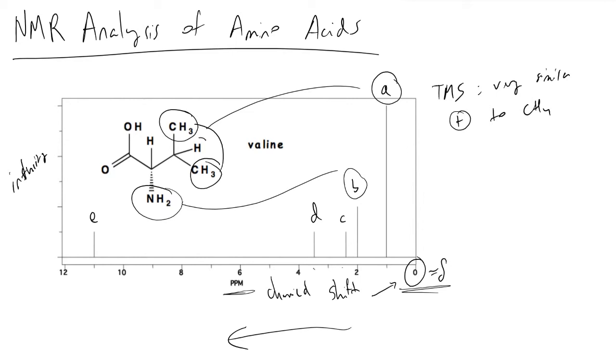Peak C is the next peak we'll come across, and the way it generally works is you can use your intuition to an extent. When we start getting peaks very close together like this, you really need to memorize and look to tables to determine this. We've got these terminal methyl groups here.